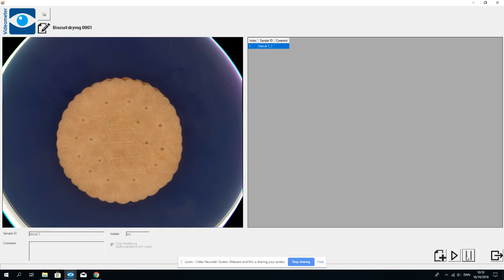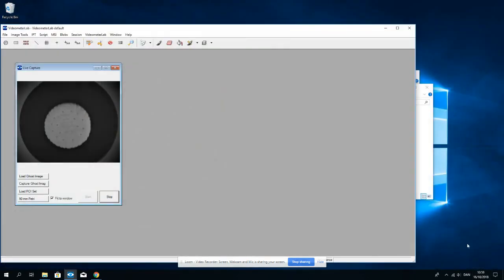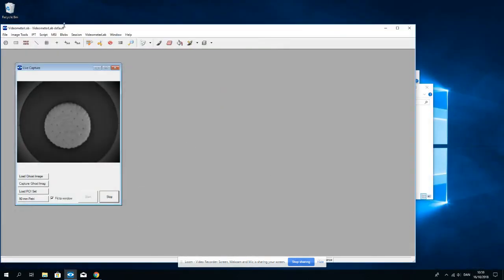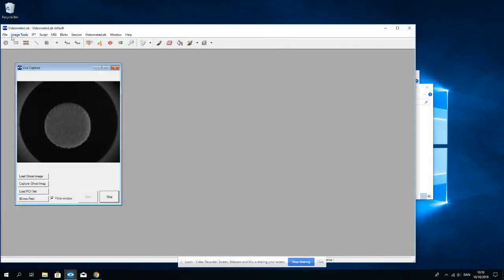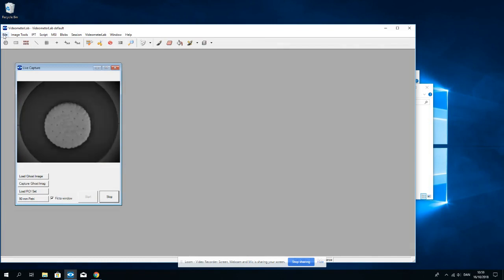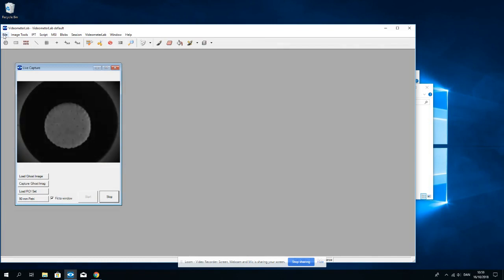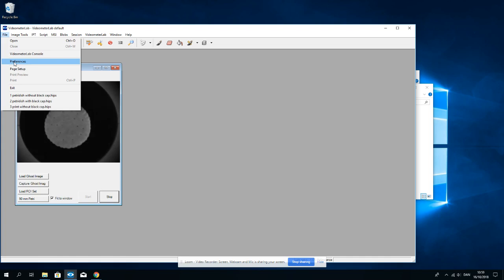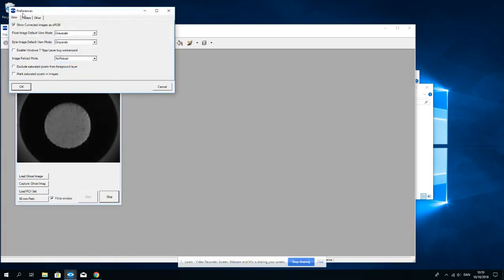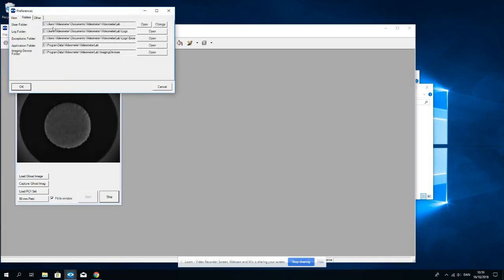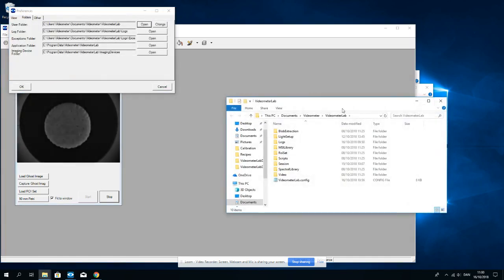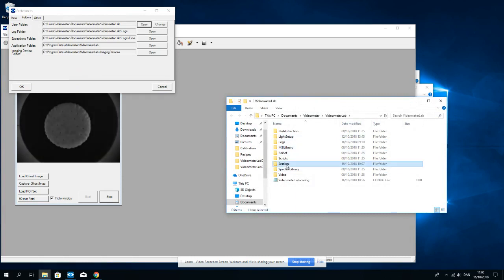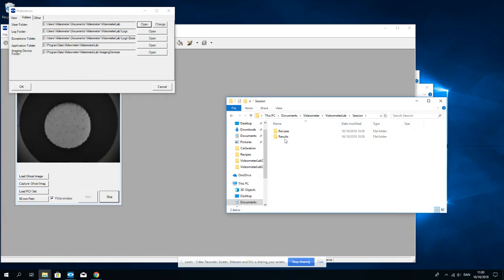I will stop the acquisition here and leave the application and I'll just show where the images are. Once the session has been finalized, I go to Preferences, Folders, User Folder, and under Session, we will find Results.